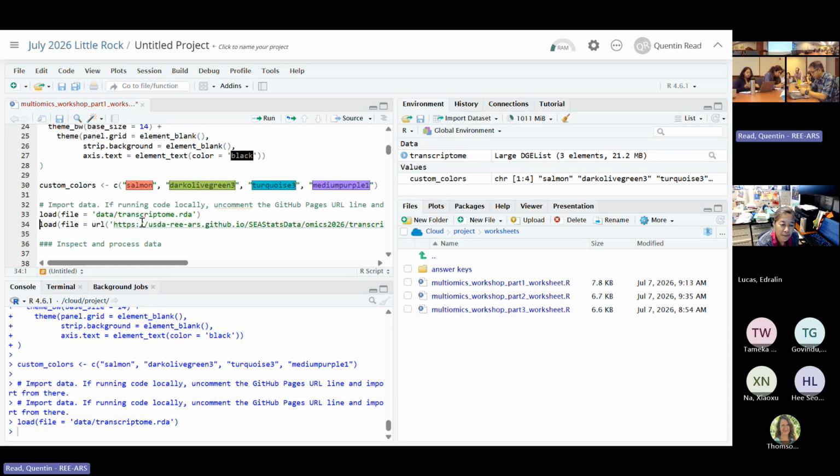Are you doing it locally? Did you run the installation on the tutorial? Because it's getting errors, probably not. For now, you're not going to need ggplots yet, but here, let me see. Take that out. No worries. So yeah, that worked. Got the transcriptome. So ggplots didn't work.